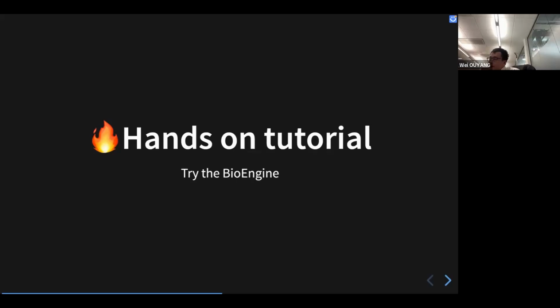Okay, so please make sure you click the link in the chat. And if possible, use Chrome or Firefox, because we didn't test with other browsers. Yeah, so we're going to do copy. So I will let Jeremy do this tutorial with you.